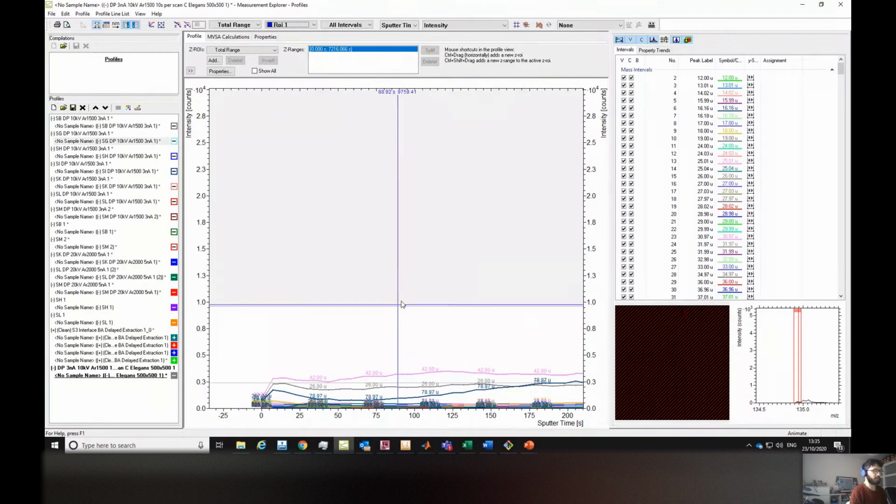And then you saw, right, it takes a while to update. So the larger your data set is, the longer it will take, and then the larger the pick list as well, the longer it will take. So sometimes it even crashes, so just be aware of this. So now it's just showing the profile. It's showing the profile only for the region. So I'm ready to export.